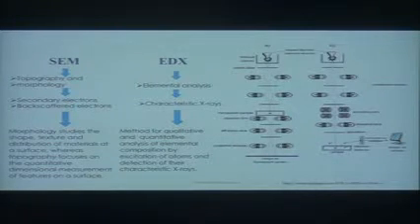So SEM, pure SEM, will give you morphological information, topography, and morphology. Morphology is the surface shape and texture of materials on a surface, and topography is more about the quantitative dimensions of a surface. So they're very much related.